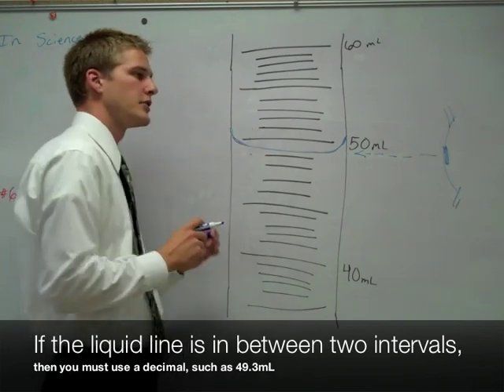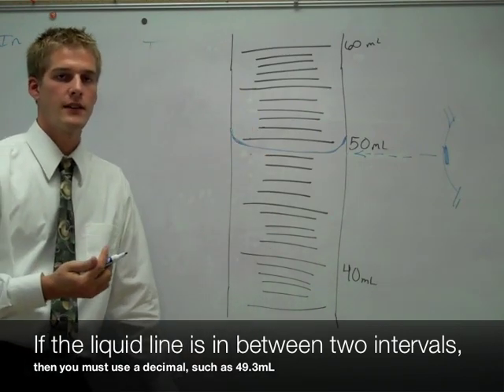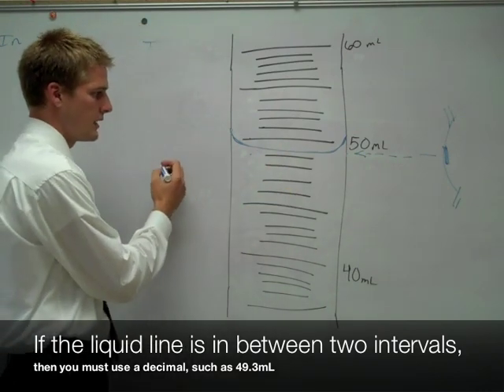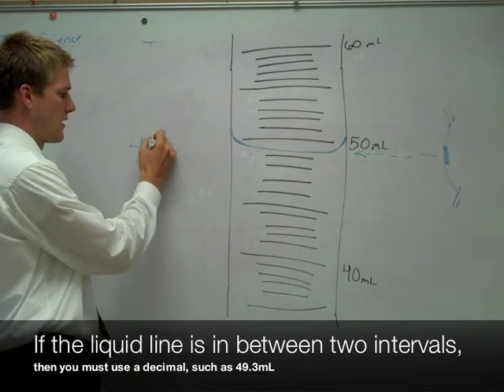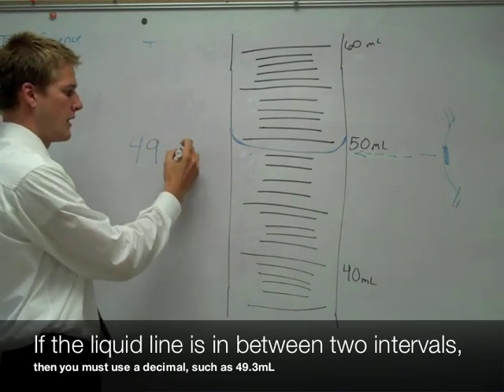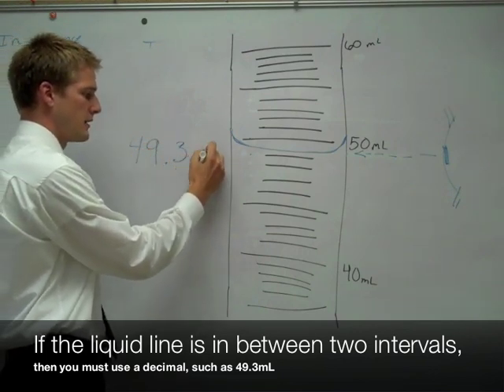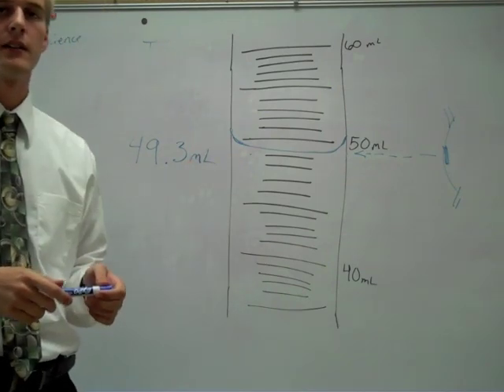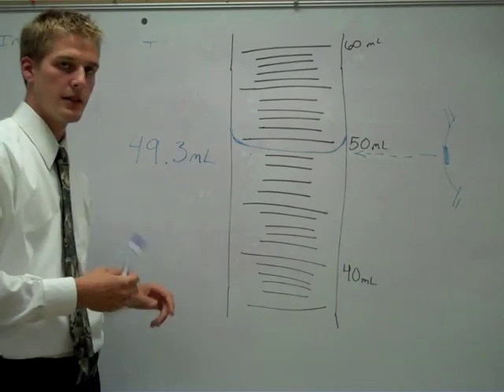50 is here. So, you know it's somewhere in between 49 and 50. However, it's lower than halfway. So, this is going to be 49.3 milliliters. Because it's not on a line, you need the decimal point. So, it's 49.3 milliliters. And that's how you read a graduated cylinder.